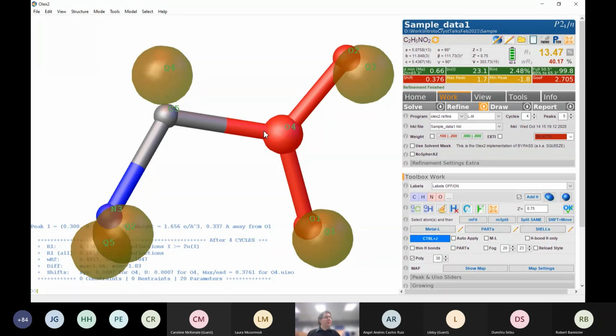Simply, the one thing you've got to remember about a crystal structure is it is still the average of billions, trillions of molecules, and they're all still vibrating because we very rarely run this at absolute zero. So you'll get an average of their positions, so anything that's terminal will still always vibrate slightly more.